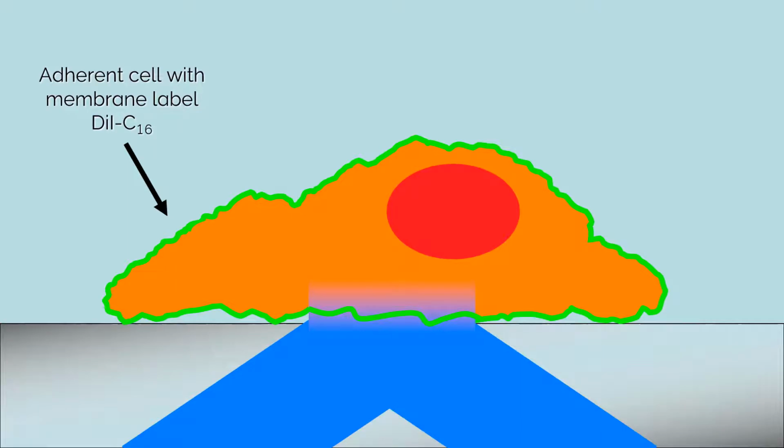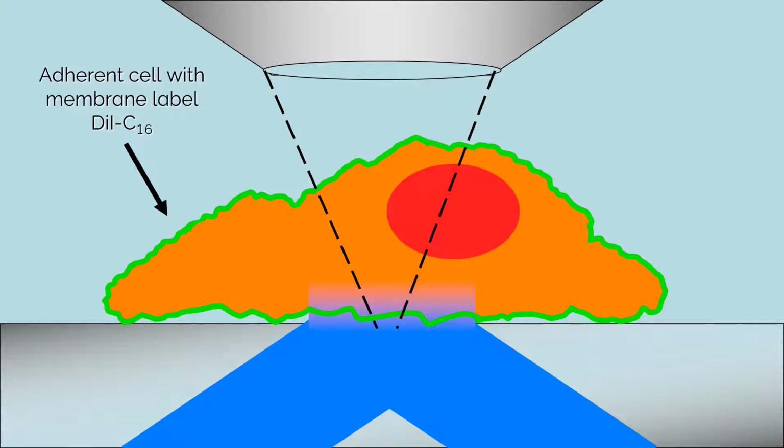Axelrod had labeled the cell membranes of these cells with the fluorescent lipophilic carbocyanine probe DiI-C16. Using evanescent illumination and focusing the microscope through the specimen and onto the basal surface of the cells, Axelrod was then able to obtain an ultra-clear picture of the cellular membrane regions in contact with the glass interface. Essentially, he was able to see the cell's fingerprint profile because of frustrated total internal reflection. This gets to the optical sectioning concept of seeing more by illuminating less.